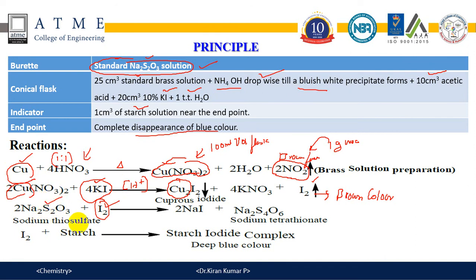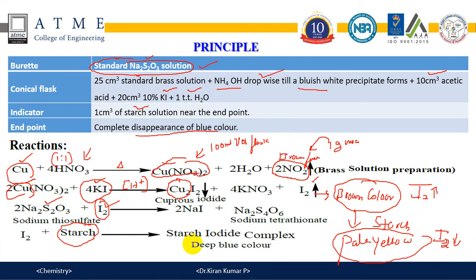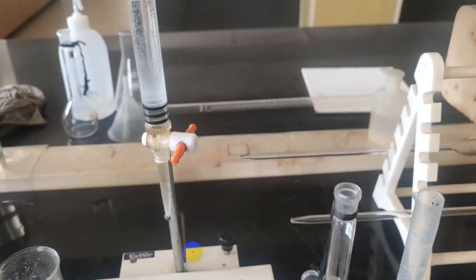The end point is determined using a freshly prepared starch indicator, which is added near to the end point — not initially. The solution will be dark brown initially. When the iodine concentration decreases to pale yellow, that indicates iodine concentration is less — add starch indicator at that point. When starch indicator is added, the solution becomes deep blue color. Titrate again until the blue color completely disappears and there is no change in color.